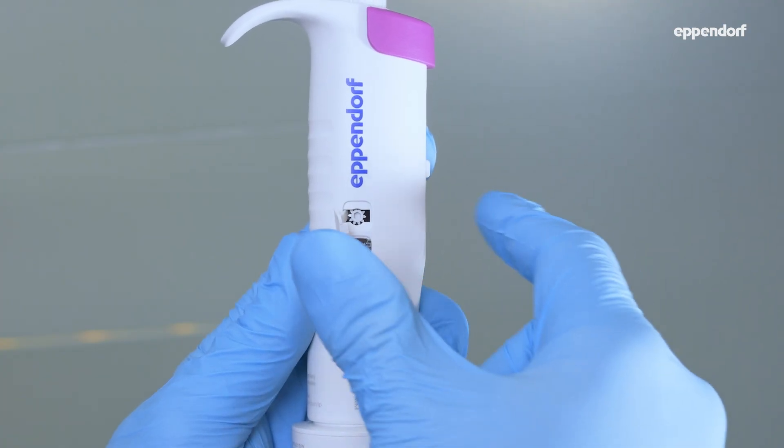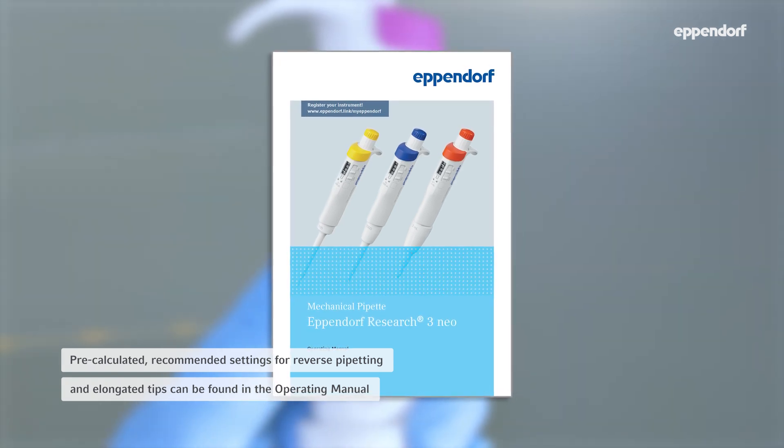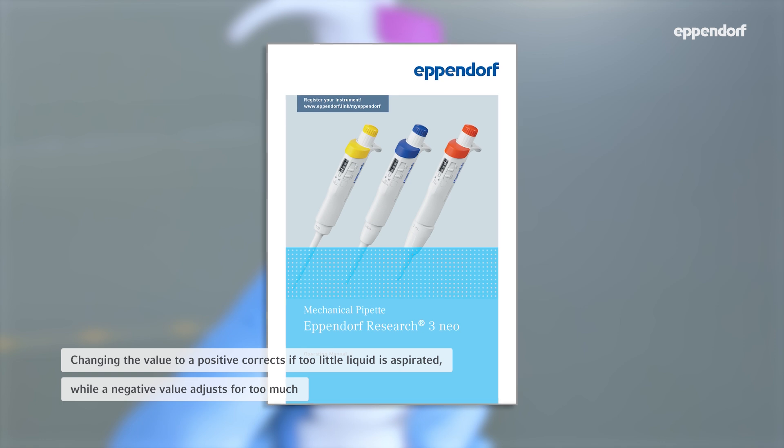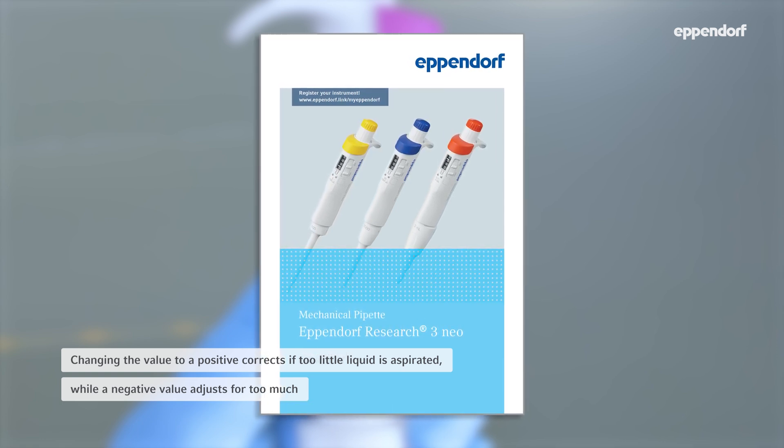In the operating manual, you can find pre-calculated, recommended settings for reverse pipetting and elongated tips. Changing the value to a positive corrects if too little liquid is aspirated, while a negative value adjusts for too much.